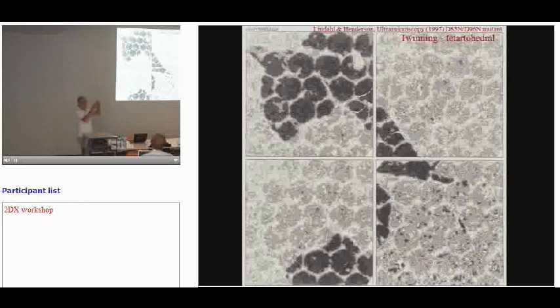And then each crystal, you diffract it, you get spots. Actually, they look nicer because since you've got the average of 4 different orientations of the crystal, all the spots which were weak before, because there's a 0 there, get replaced by a bit of one crystal, a bit of another. You have an average. So actually, they all look rather more even and somehow you think you pick them out. These ones are better, but actually they're worse. And this was a particular double mutant, which is rather unstable, and you couldn't ever get big coherent areas.